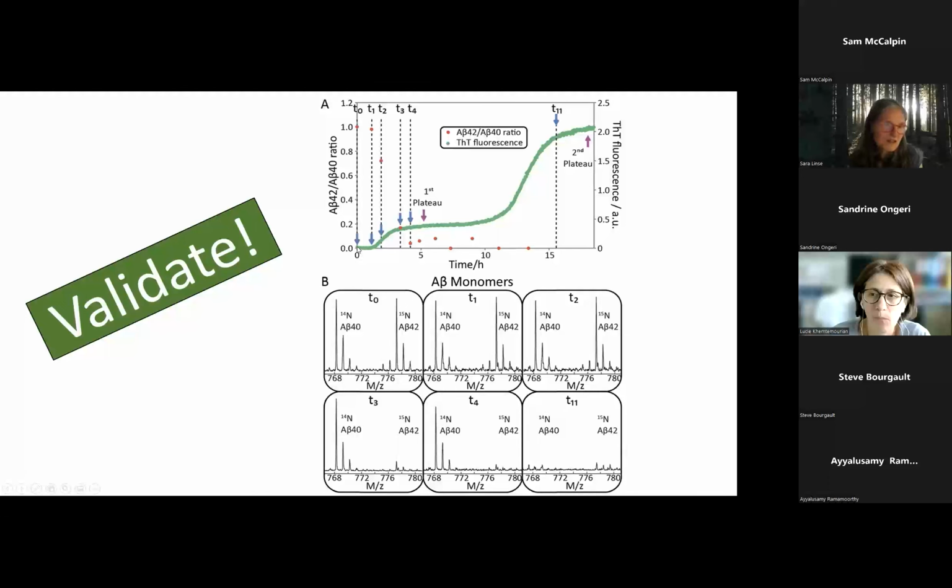They could see that at time 0, nothing has really happened. They are both at the same concentration. At the end of the lag phase, it's the same. I mean, the monomers, in principle, you have all the monomers left here, although you have formed fibrils, but the fibrils are not above the signal to noise level of the assay. And also the monomers have not gone down below what you can detect, what is the signal to noise level of this assay.